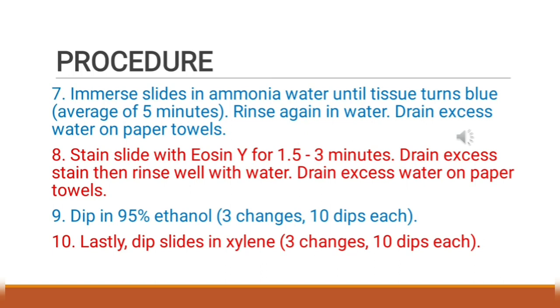Next is to immerse the slides in ammonia water until tissue turns blue with an average of 5 minutes, or you can use 1% aqueous lithium carbonate in case ammonia water is not available, until the sections appear blue for about 30 seconds. Then after that, you must wash again in running water for 5 minutes and then drain the excess water on paper towels.